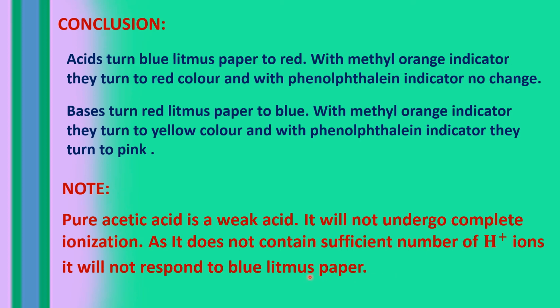Okay, so this is a small activity where we could make a difference between an acid and a base based on the litmus paper as well as the indicator. I hope you understood.